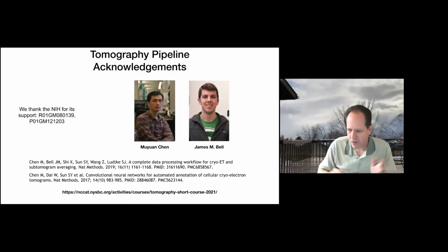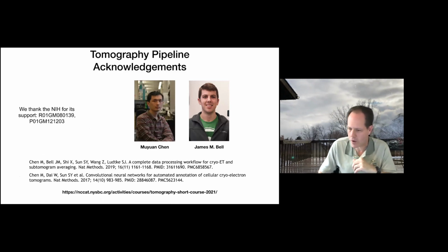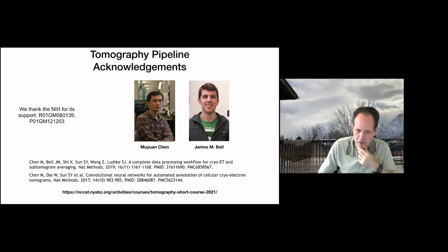Okay, so that's all I'm going to say about compression. Like I said, that's not published. The paper about it isn't published yet, but EMAN 2.1 already is using that strategy by default.